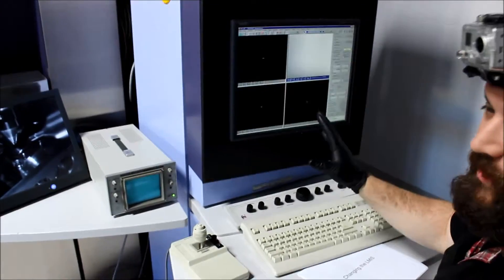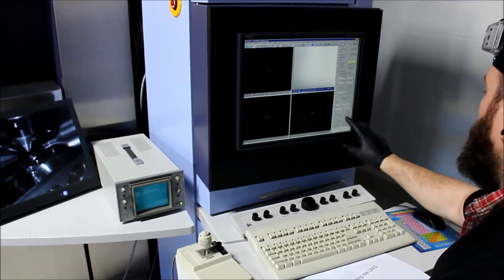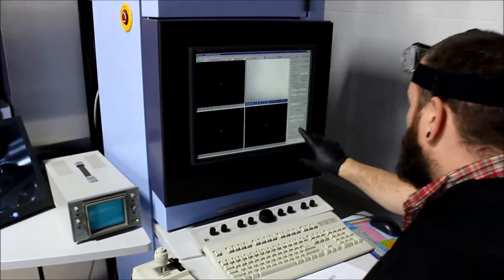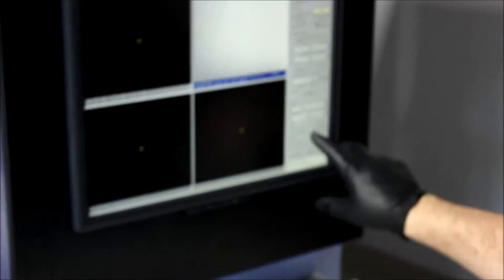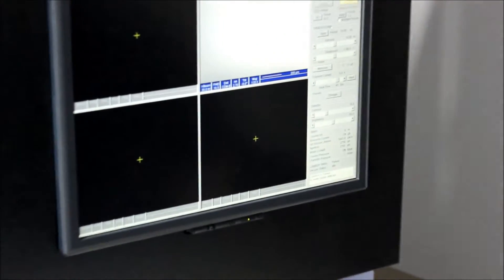I'm going to show you how to change a liquid metal ion source on an XL830. We can see here that this ion source had a pretty good lifetime of 5400 microamp hours, so it's time to change it out.